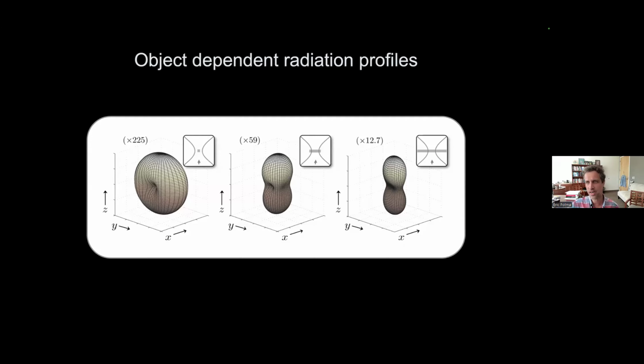And that has really funny effects. So let's look at one particular spot, like one molecule. What if I do nonlinear optical microscopy in the coherent domain, and I just drive that and look at the emission profile of a single molecule? You get this kind of donut shape, and most people recognize this as a Hertzian dipole, and that's because it is.